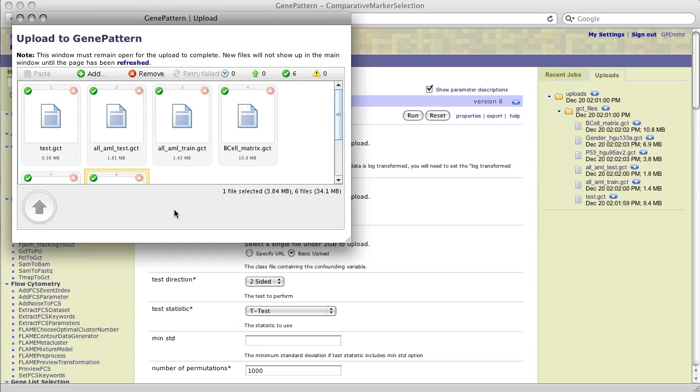While it is perfectly fine to change the focus away from the uploader while it progresses, it must stay open. If you close the window, the upload will terminate. Once the files have finished uploading, you can remove single or multiple files from the list by highlighting them and clicking Remove. If any files had failed during upload, you could retry those failed uploads by clicking the Retry button.